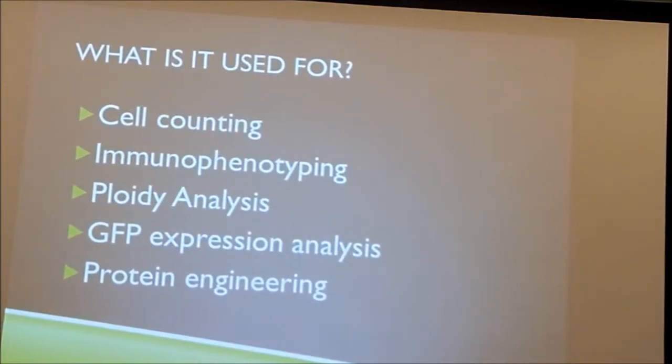Flow cytometry is used for a multitude of things, such as these listed, and in examples such as in marine biology, you can characterize the abundance and community structure of photosynthetic plankton by using autofluorescent properties, and in medicine for transplantation, hematology, tumor immunology, chemotherapy, prenatal diagnostics, genetics, sperm sorting, diagnosing blood cancers, and evaluating the progression of diseases such as AIDS.